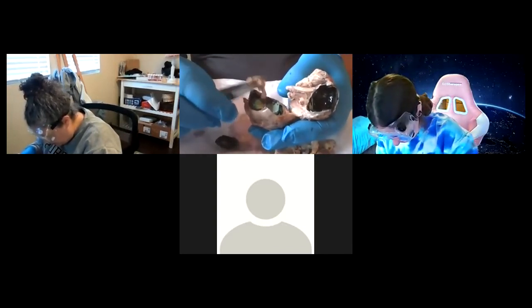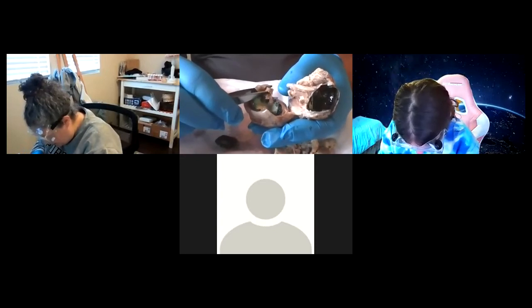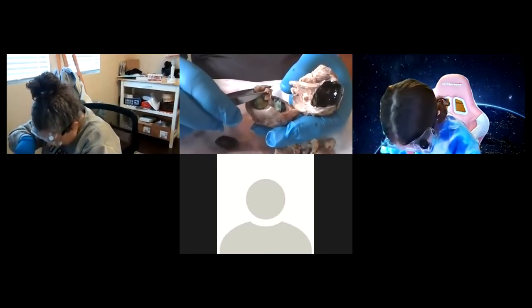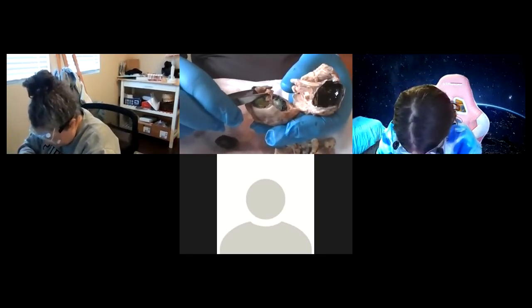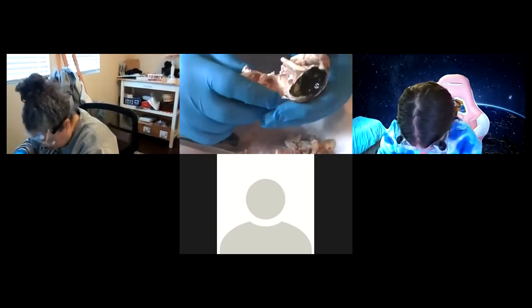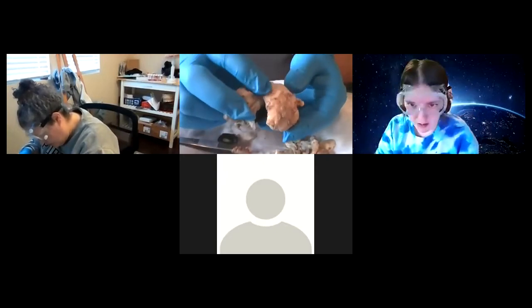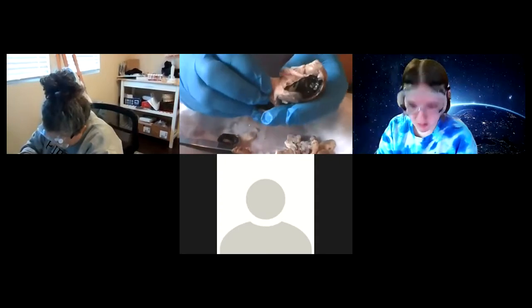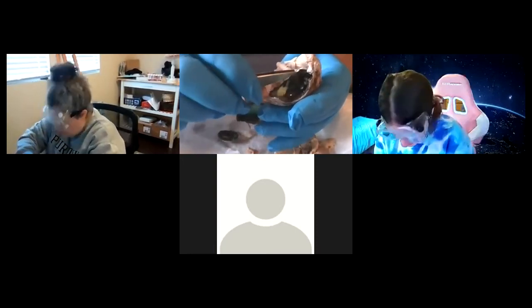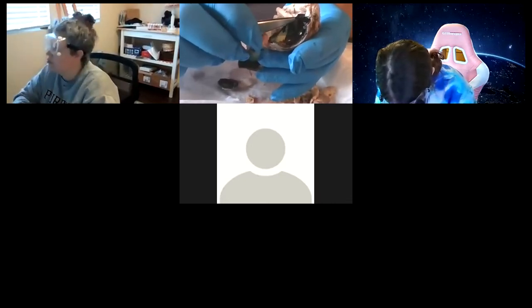The retina is not really connected to anything, so the vitreous humor holds it in place. This is why it's so important that the posterior chamber of the eye has a proper pressure — like 16 millimeters of mercury — to hold that retina in place, otherwise it's going to detach. A condition called glaucoma is excess pressure in the posterior and anterior chambers. So the retina is very delicate, and these photoreceptors are too. Going back to the optic nerve — as the optic nerve goes into, or comes out of, the eye, there's a spot on your retina right there. That is the blind spot. Where the optic nerve exits the eyeball, there are no photoreceptors, and that's why that area is called the blind spot.